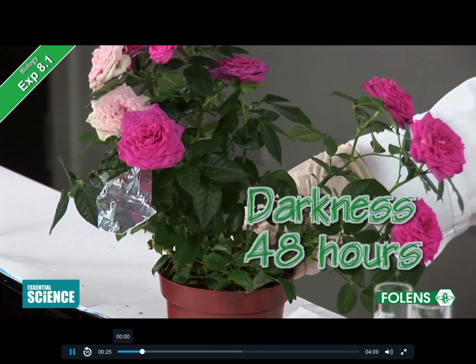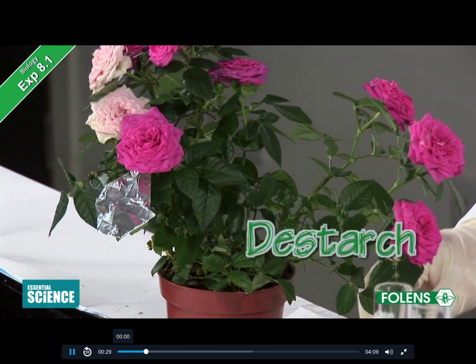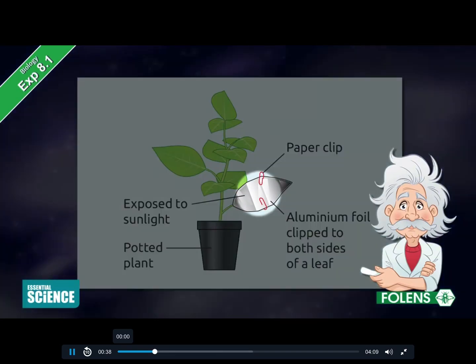This plant has been in darkness for 48 hours. This was done to de-starch it, meaning it used up all its starch. The plant was then removed from the dark and some of the leaves were immediately covered with aluminium foil to block out any light.